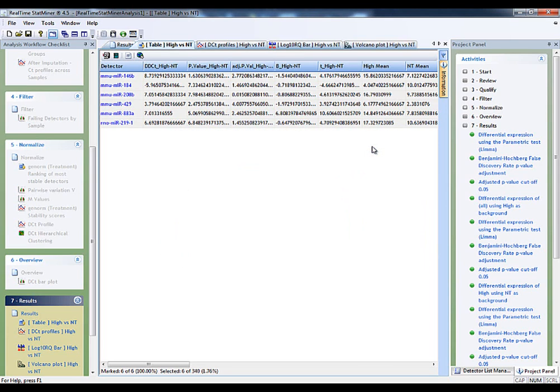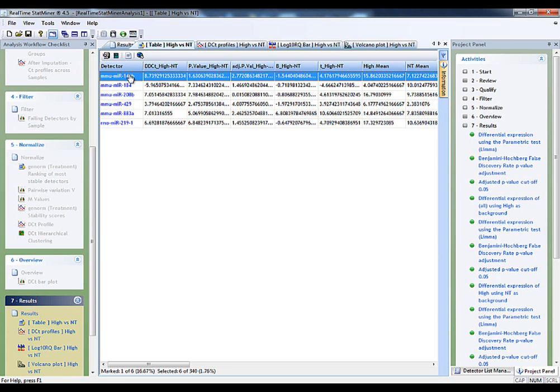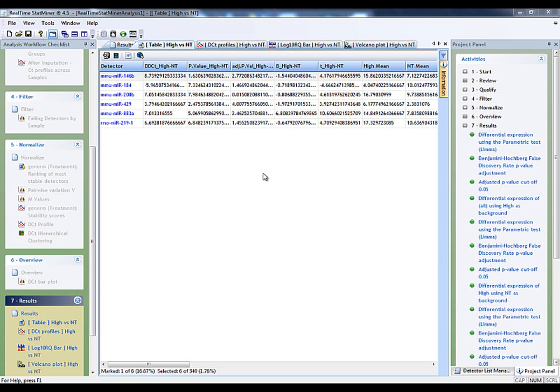It is recommended to check the user manual for the section that describes how this URL works. For the purpose of this tutorial, we are now only connecting with the Sanger website for our detectors of interest. However, we can set up additional queries to multiple sites if needs be. We are done. Now let's apply our template.